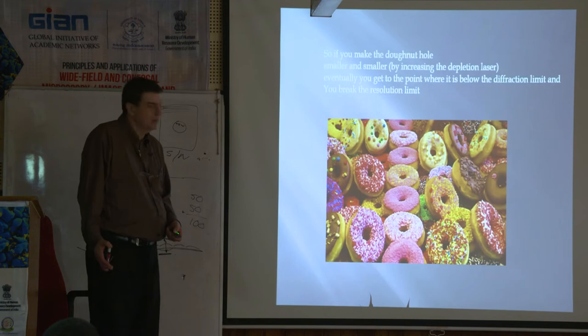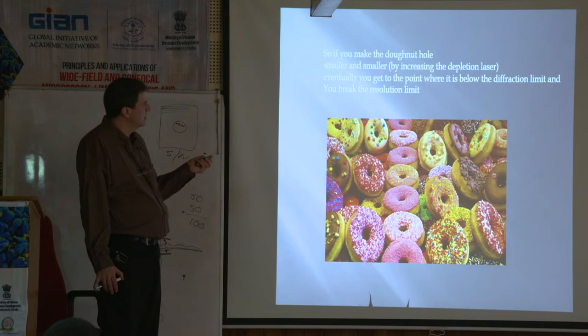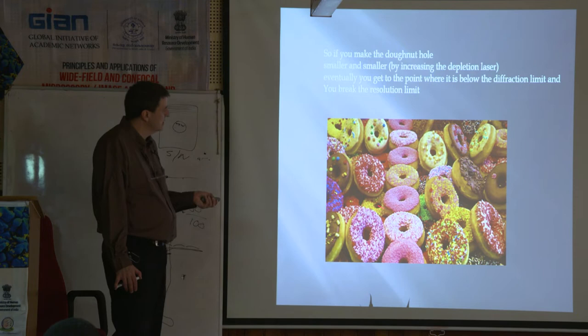Okay. So if you make the donut hole smaller and smaller, eventually you get to the point where it's below the diffraction limit and you break the resolution limit, and you can celebrate by having a whole bunch of donuts to eat. Okay.